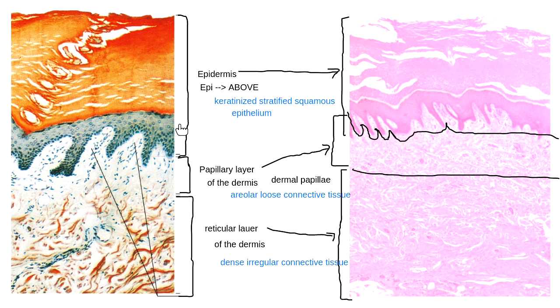But there's that middle part in here that's a little darker that looks like I think it's like stratified squamous type of tissue. Yeah, so that's a great question.